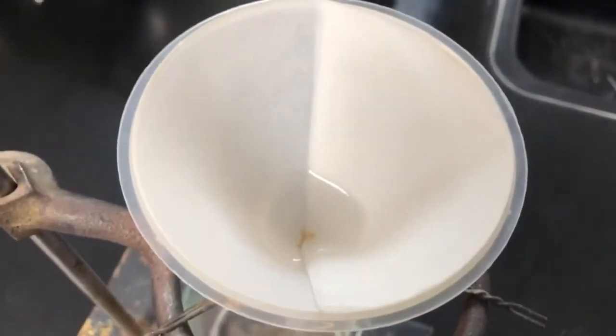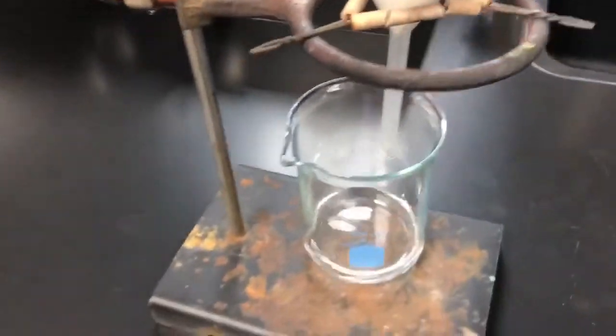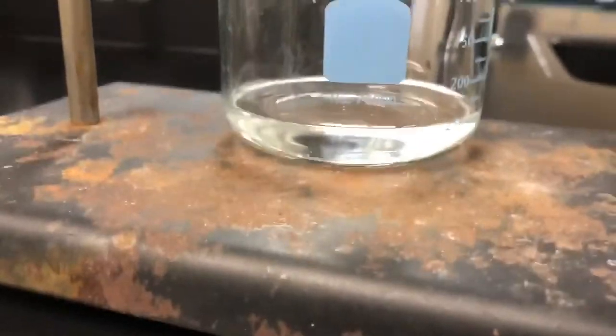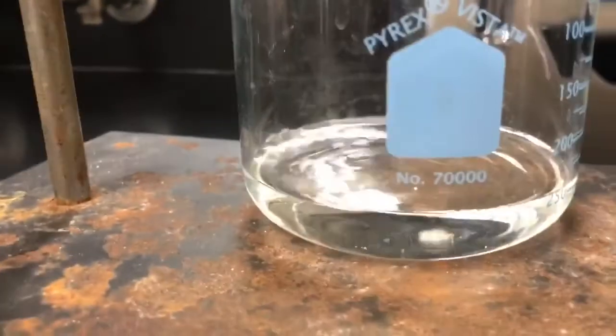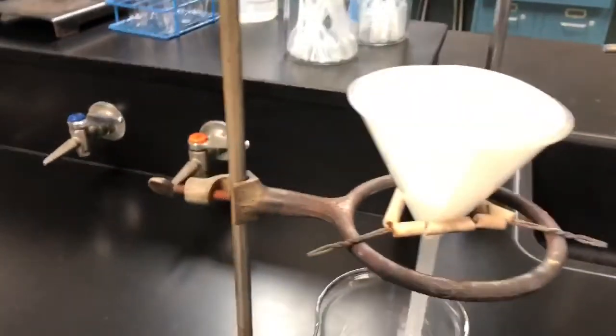Going back to our gravimetric filtration - it takes a little time. The question asks about the appearance of the filtrate - it looks pretty clear, which is what it should be. The sand remaining in the filter paper is your residue.